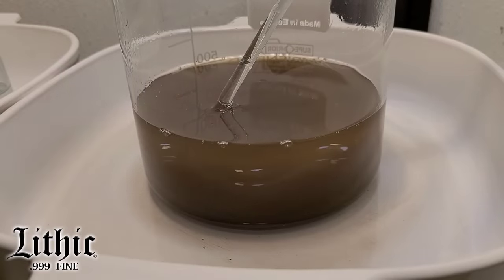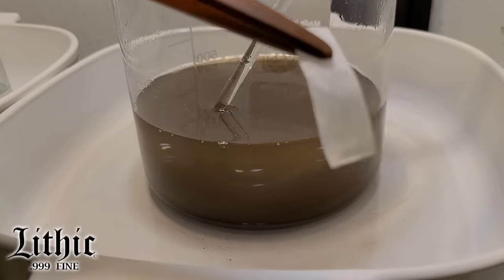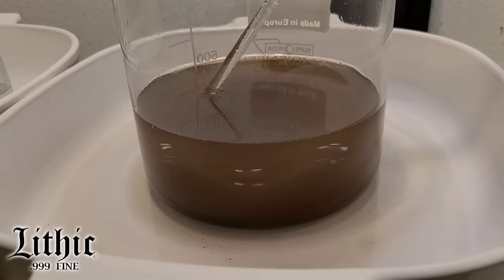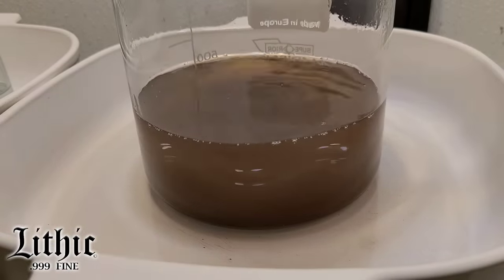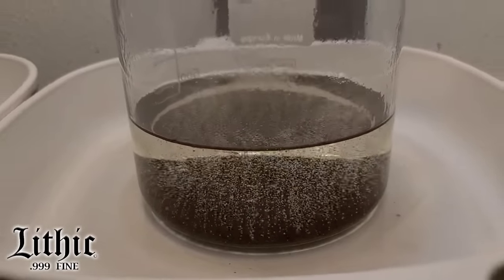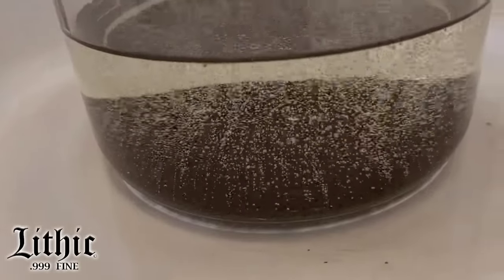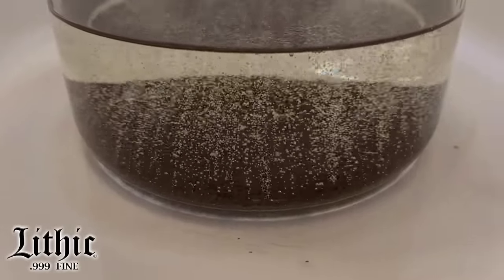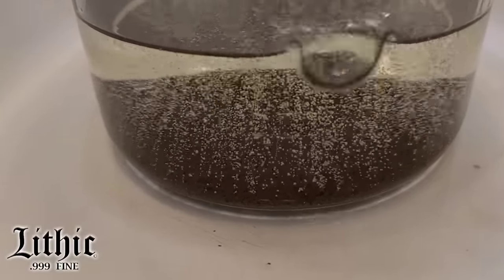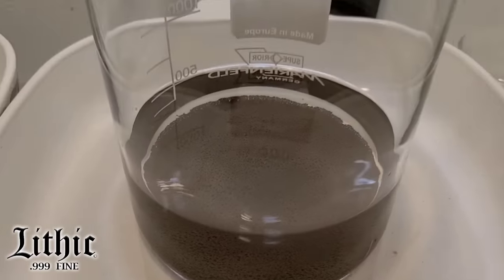Let's test our solution again with a little more stannous chloride. Clear — no reaction. Good. We dropped our gold out of solution. I've got to let that settle, so I wanted to speed it up just a bit — I turned the heat on, and that boils everything apart and settles that gold out pretty quickly. Nice light rolling boil. After that's finished, I let it cool, let everything settle, and we'll decant this.